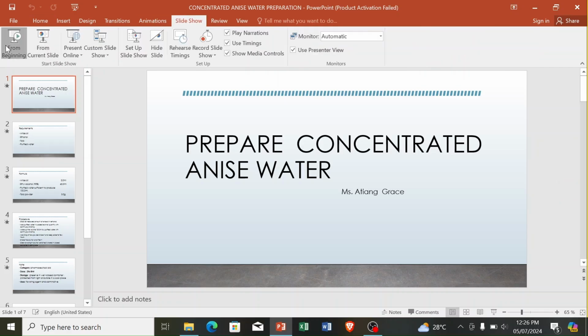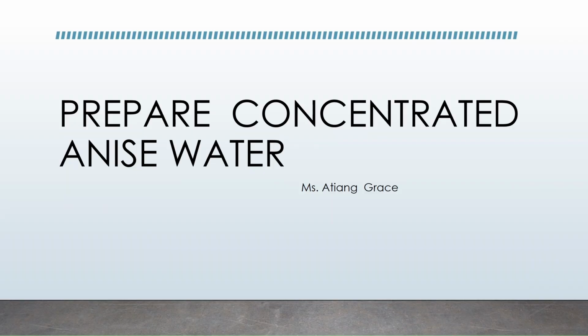Welcome back once again. We have something new today that we are looking at, and that is preparation of our concentrated anise water.